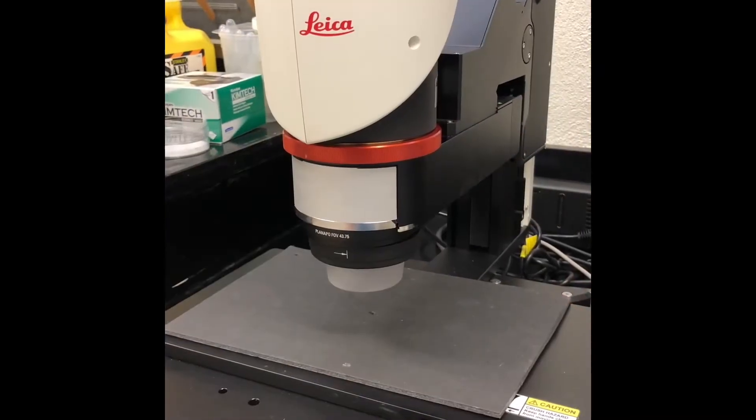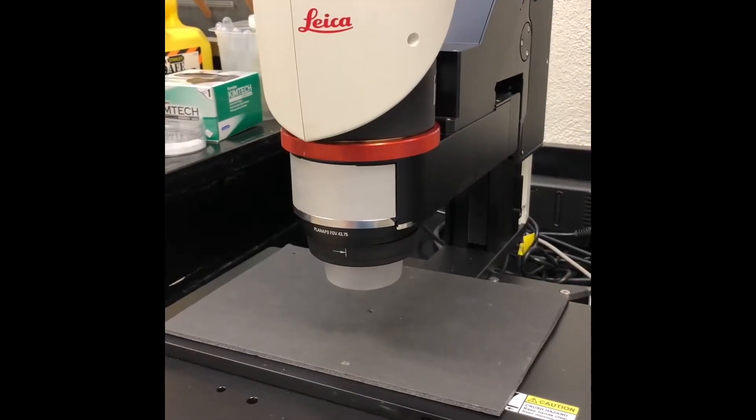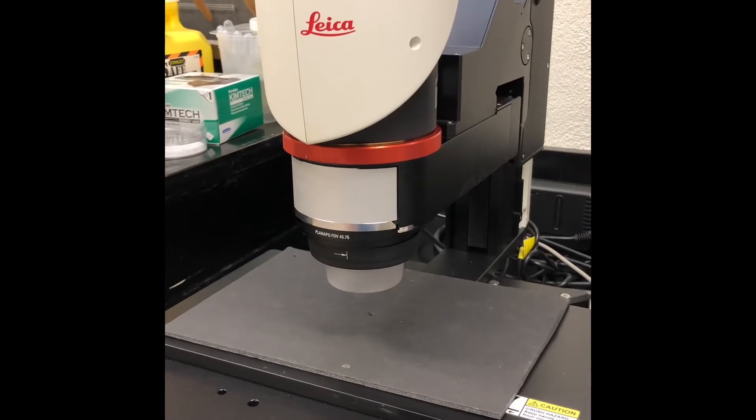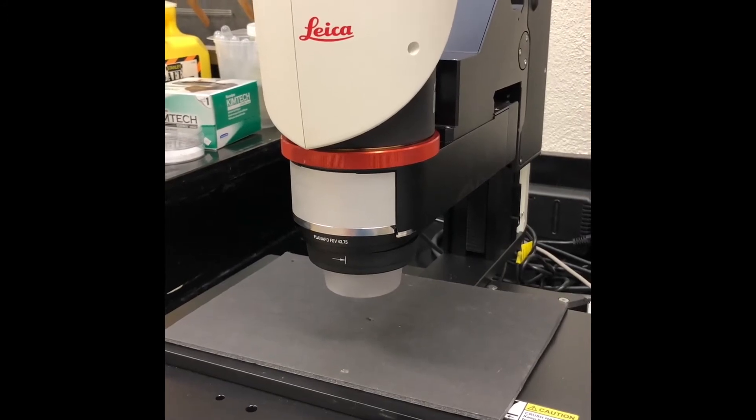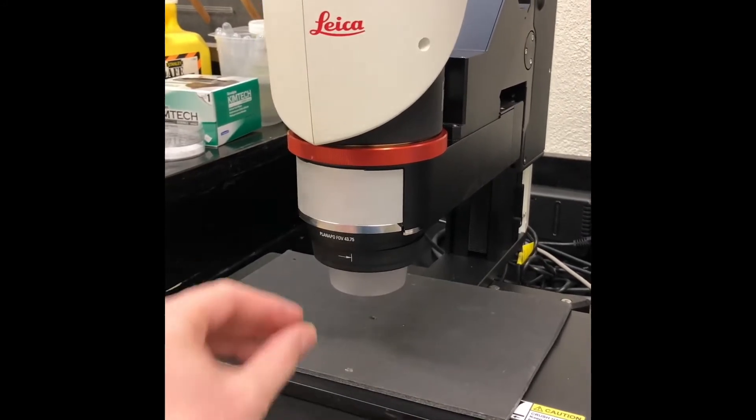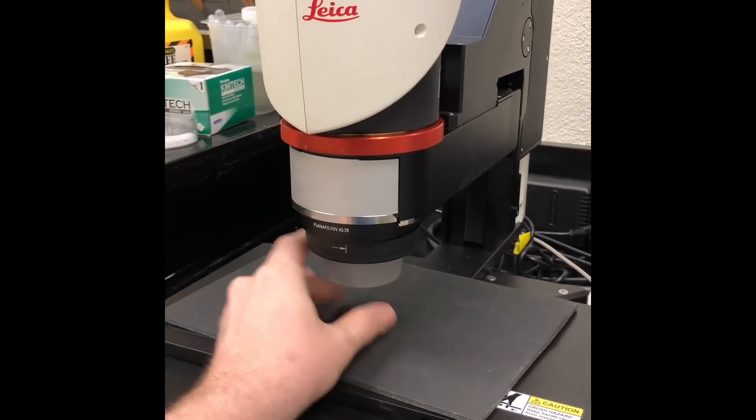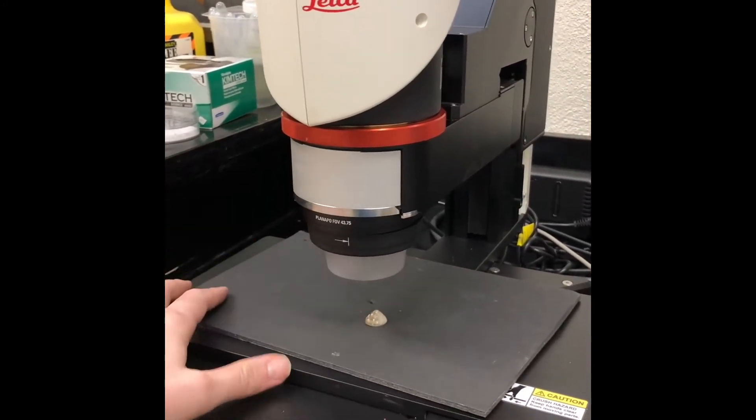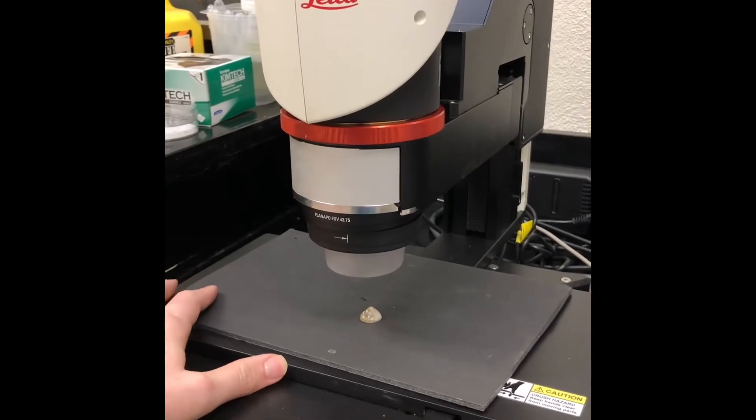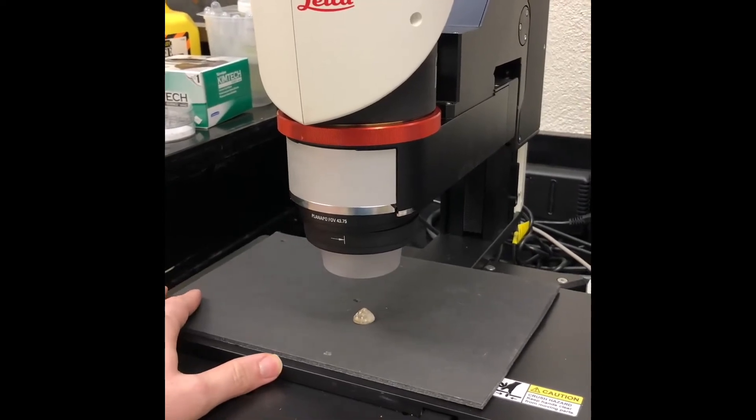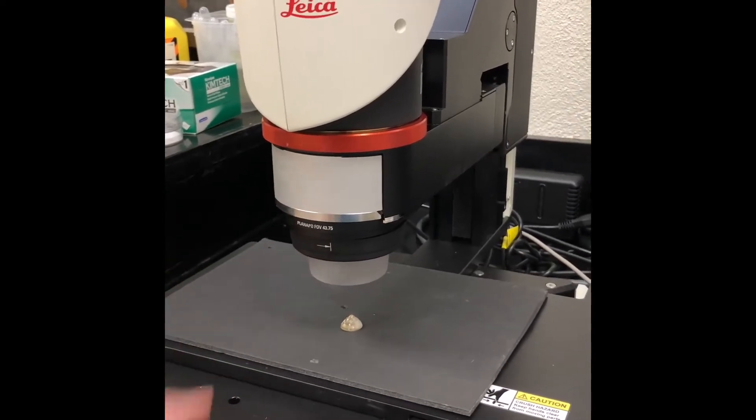The first thing to do when using the Leica DVM-6 for imaging is to place your sample, in this case we'll be looking at a seashell, underneath the microscope.